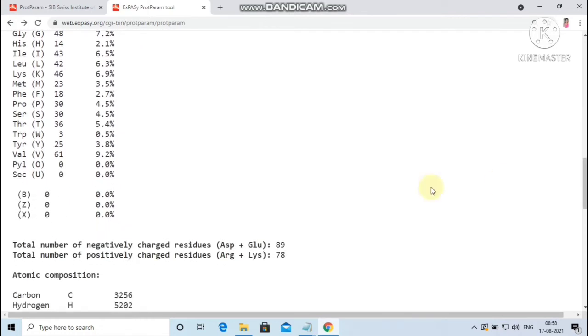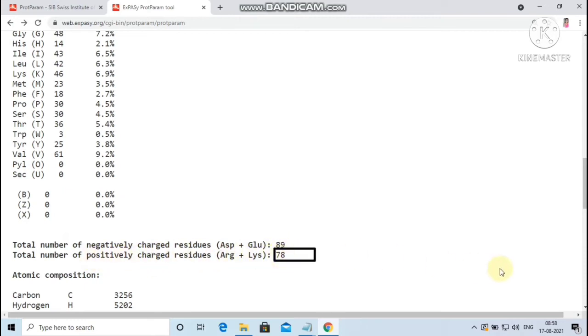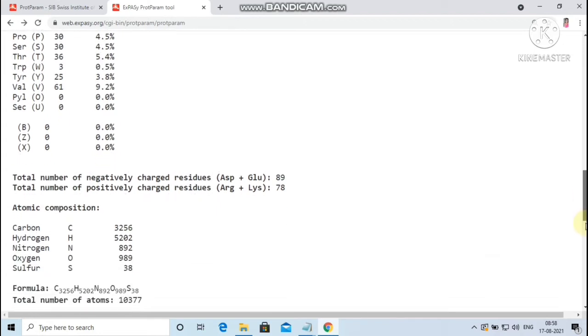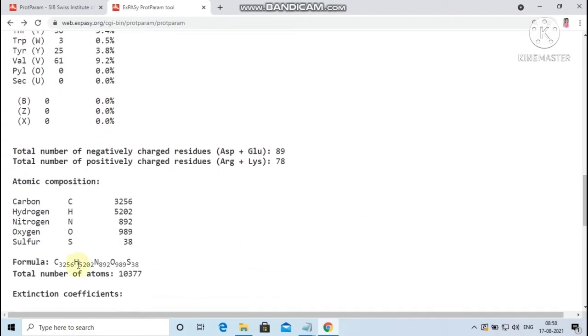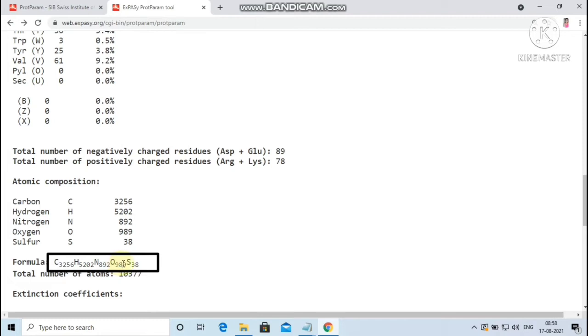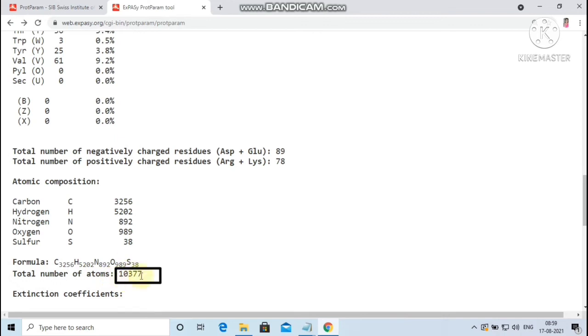The total number of negatively charged residues in this protein is 89 and the total number of positively charged residues is 78. The formula of the given protein with the atomic composition is given as carbon 3256, hydrogen 5202, nitrogen 892, oxygen 989, sulfur 38. The total number of atoms present in the given protein is 10,377.